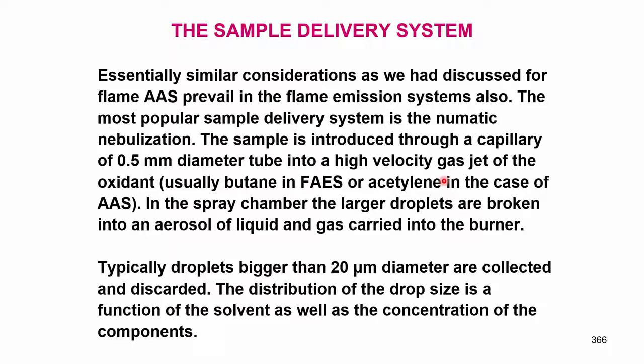You would have seen such nebulization in your day to day life whenever you use a perfume spray. Most of the perfume sprays we normally use after bath contain a low boiling liquid, something like alcohol along with some perfume, and with a small nozzle at the top you just press it, the liquid is sucked and then delivered through a small nozzle as a spray which we spray all around our body. So, essentially that is what we are talking about.